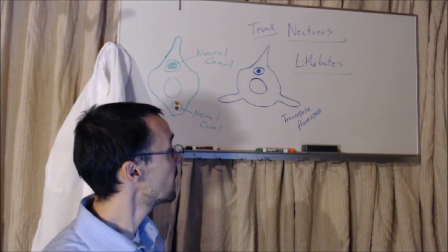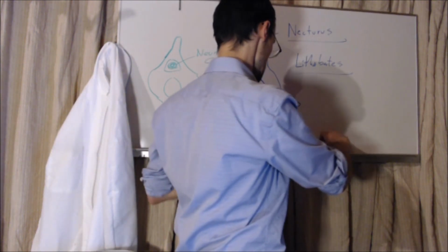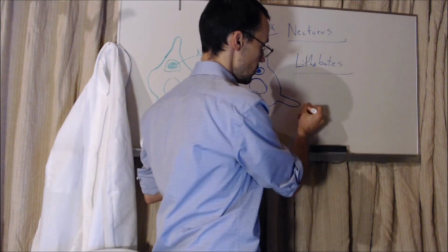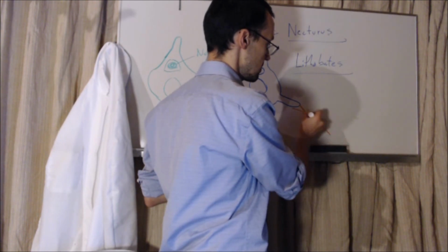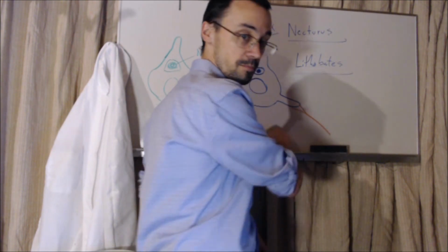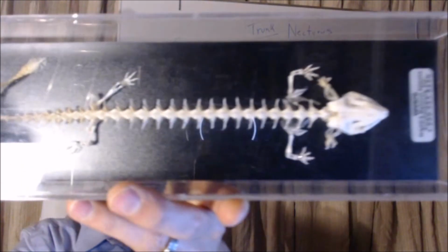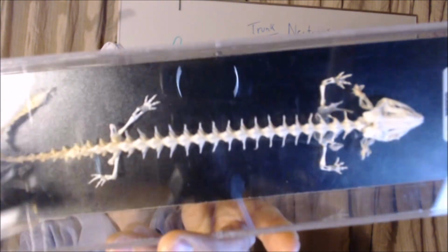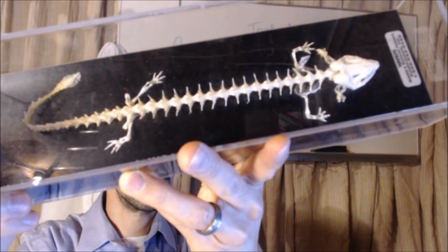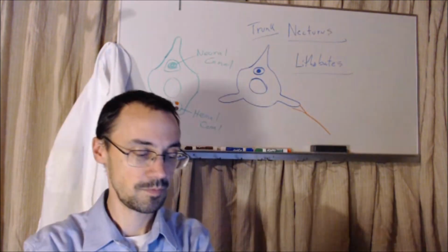it's these transverse processes where I'm going to see ribs articulating with the vertebrae. And so if I drew a rib, the ribs are actually Y-shaped, and they look like that. And if you look back at our Necturus, you can see those ribs coming off the transverse processes. They're not long, like what we were seeing before, but you can clearly see them. Okay?